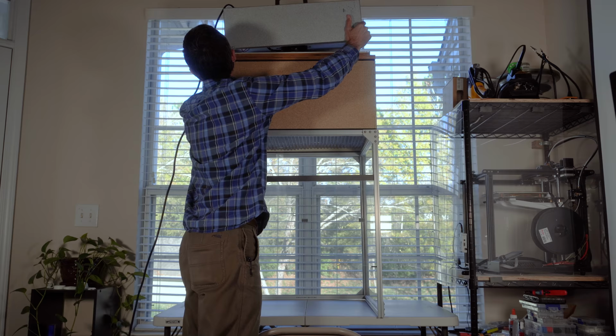Forces air down through the HEPA filter and into the hood, providing an environment of sterile air to work with the mushroom cultures.